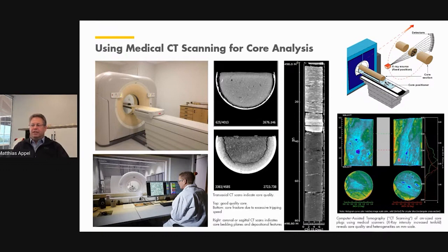You see quite some heterogeneity in what we call the Hounsfield units, so the attenuation of the X-rays. You see the brighter colors are basically stronger attenuation. You see a bit of invasion on the outside. It is not too much to worry about. You could clean it out, but you see wax inside. You see quite a heterogeneous pseudo-density profile, which means if you would make core flow measurements with that plug, most of the pore flow would go through that channel here on the inside and not all the other elements of that core plug. You would get a biased answer, biased towards the properties of that more permeable section.